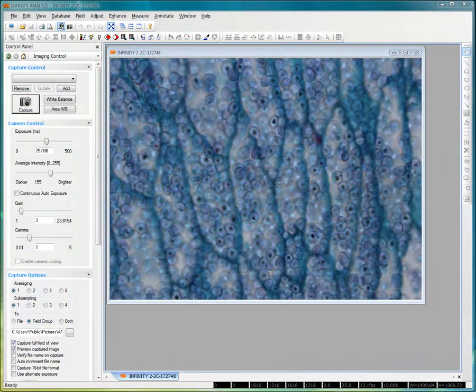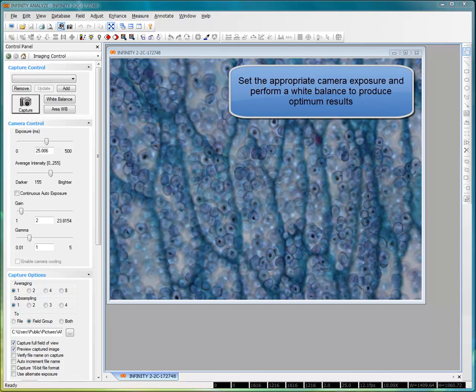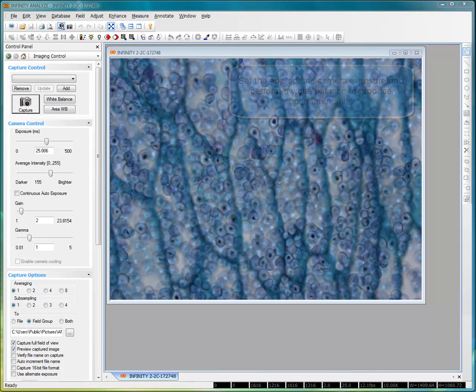We rely on the camera to provide accurate color renditions of the samples placed under the microscope, and typically the white balance and exposure controls are used to produce optimal results. Sometimes the appearance of an image can be enhanced with additional processing on the separate red, green, and blue channels. In this tutorial, we'll show how color composition can be used for image enhancements or to create striking results by combining color channels in different ways.